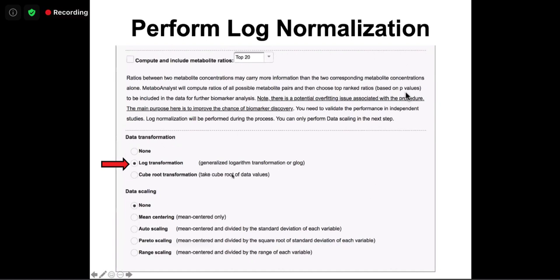And here, we click on log normalization, and we want to be as simple as possible. Why is that? You recall one question about building biomarker models: you do a lot of data processing, you change the scale. So yes, we are aware of that. We hope not to touch the raw values, but on the other hand we have to, because the downstream machine learning or statistics expect that. But we also want to use as simple an approach as possible.